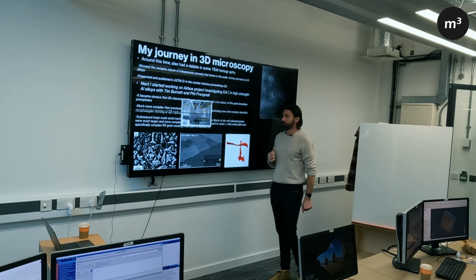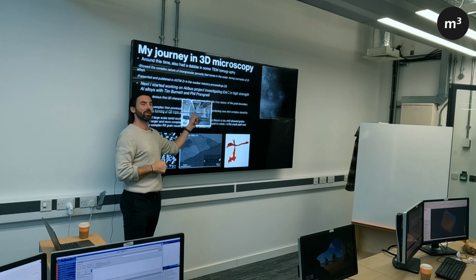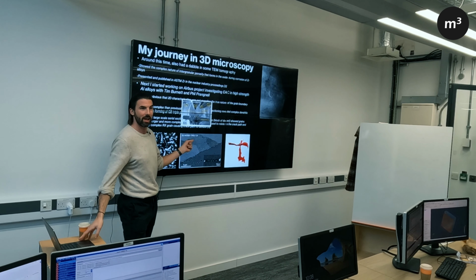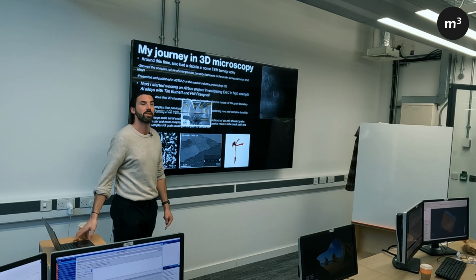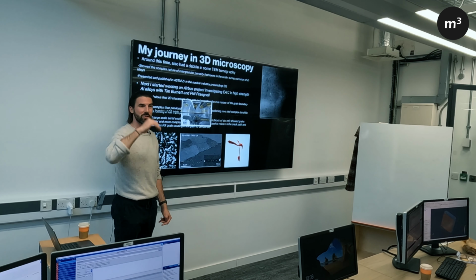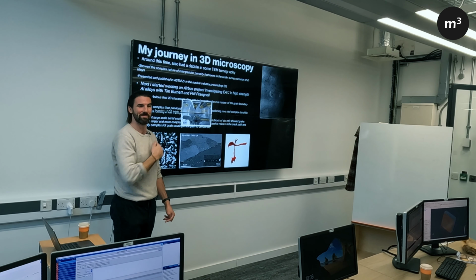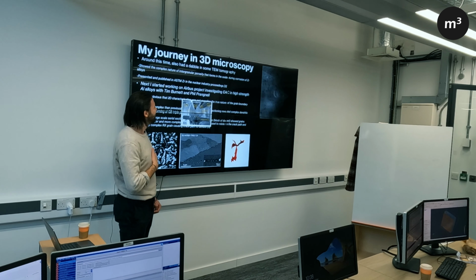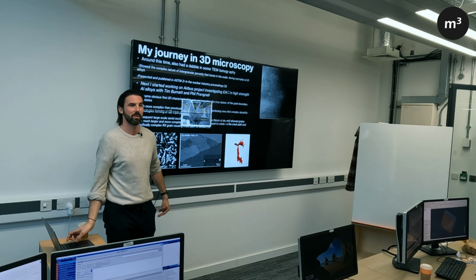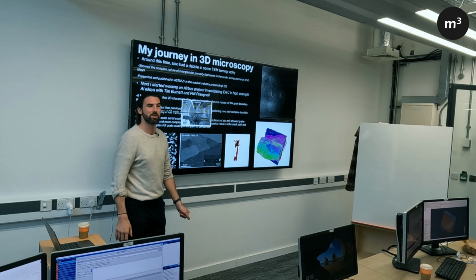Yeah. So this was the block of doom, Jack. This is actually not the block of doom. I couldn't find the photo of the block of doom, but this is the smaller one, believe it or not. So this was the first large-scale lift out we did on the laser PFIB, me and Jack. I think it took 12 days on the laser. Jack will vouch that I'm at the top of the league table for hours on the laser PFIB, on almost every system. So yeah, I think it took 12 days to dig this sample out. This was a 2mm long block, the biggest block we've ever done. We'll never do it that big because it was horrendous. And eventually we ended up not even slicing up a full grain, which was depressing.